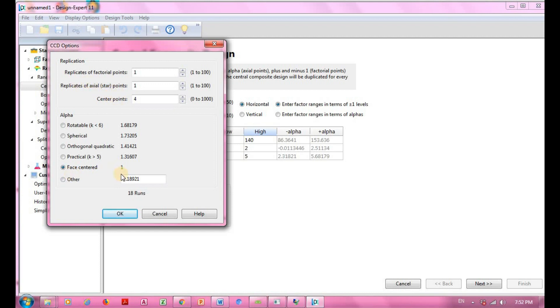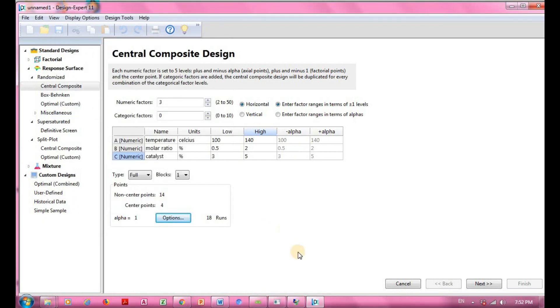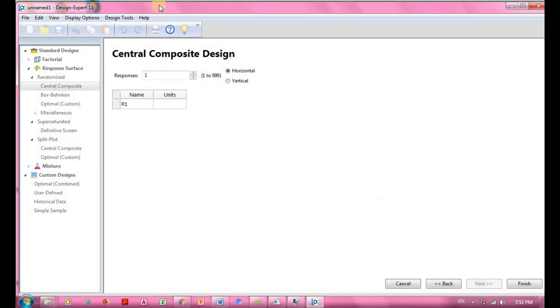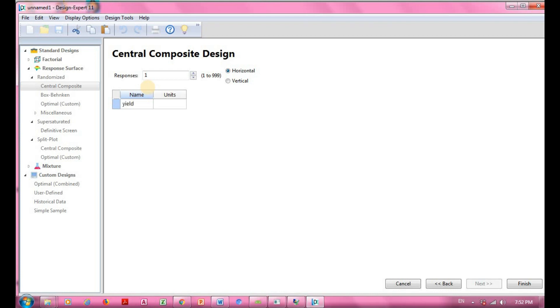Once you finish with all the settings, click OK and then press Next. Continuing through, we arrive at the response section. You can have multiple responses, but in my case I use one response, which I name 'yield' with a unit of percentage.